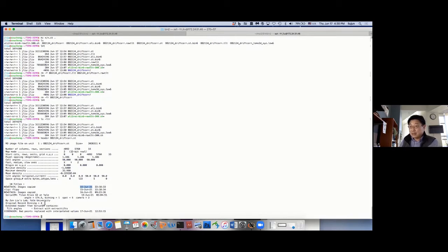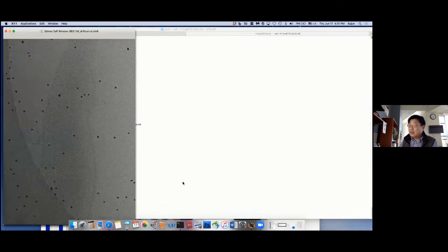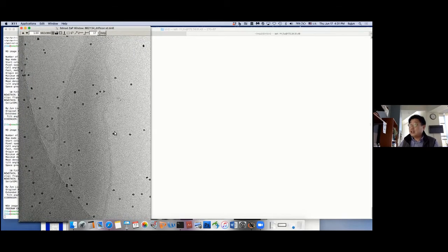The original data is very big, so we typically use binning. You can use this called Binvol, also a program from IMOD. Then you want to bin like 6 times, so this data will be binned to bin 6. Why do I use bin 6? Because now we're all working remotely, so you really don't want to open a big file. So you work on a binned file. So now this is the file. Can you see it?